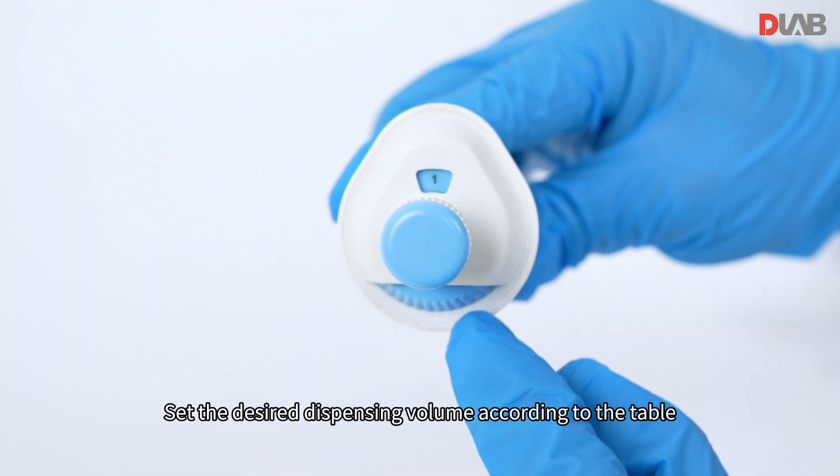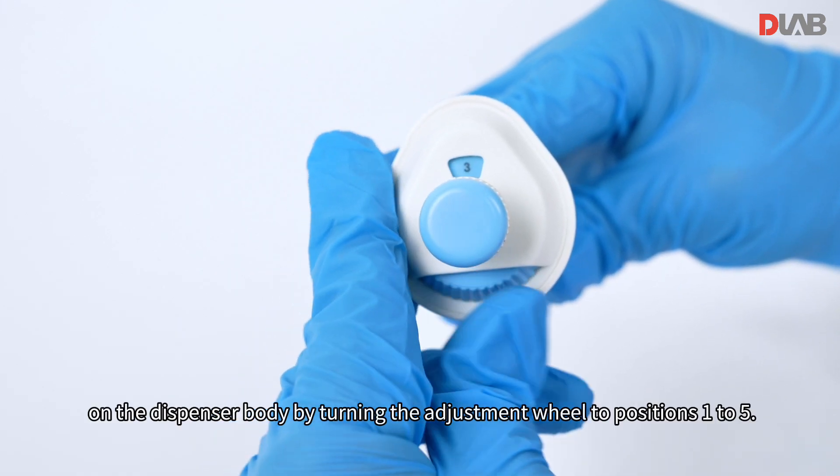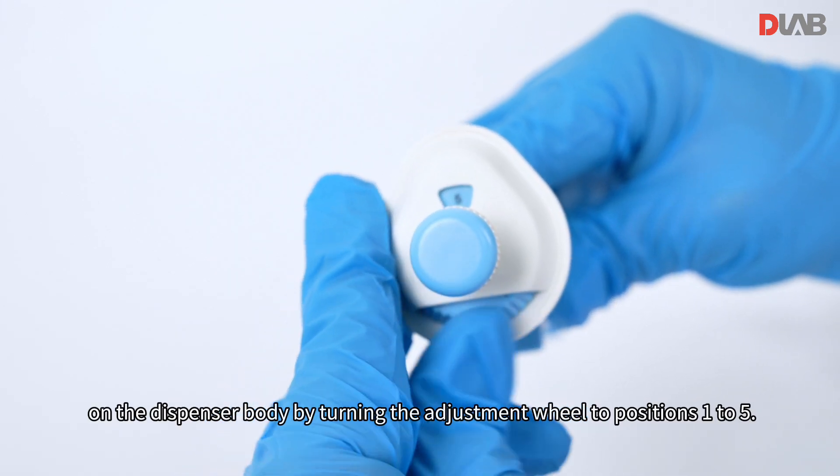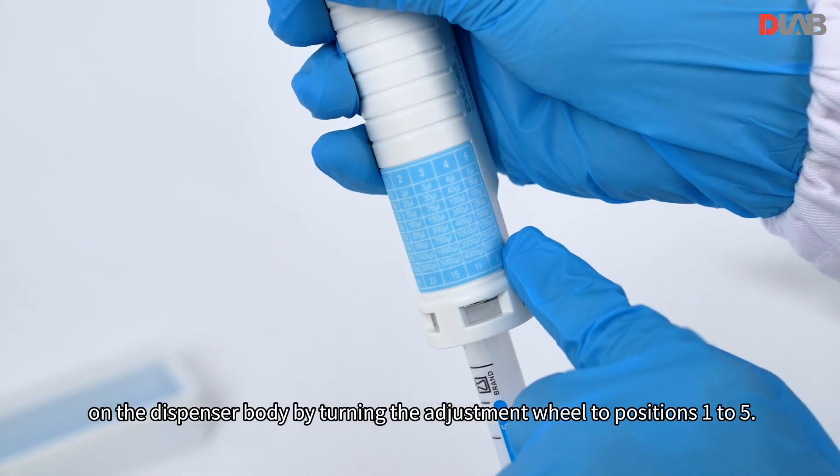Set the desired dispensing volume according to the table on the dispenser body by turning the adjustment wheel to positions 1 to 5.